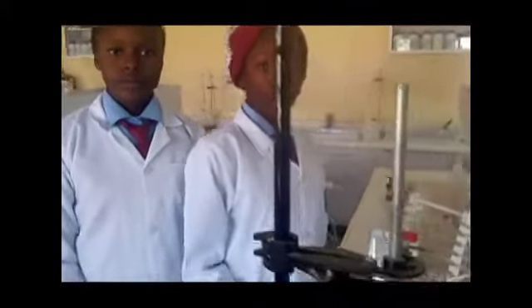Thank you. Now we are going to heat our titration. The temperature should be between 60 to 70 degrees centigrade. The reason is to acquire activation energy and to speed up the rate of reaction. If it goes above 70 degrees centigrade, oxalic acid will begin to decompose, and if the temperature is too low, that is below 55 degrees centigrade, the interaction between the oxalic acid and the potassium permanganate will move too slowly.